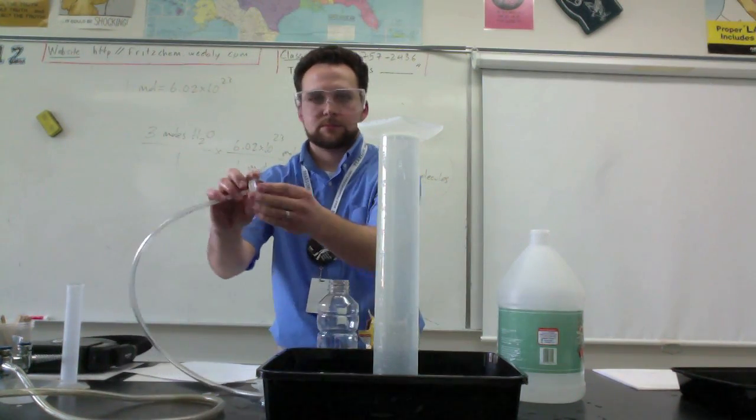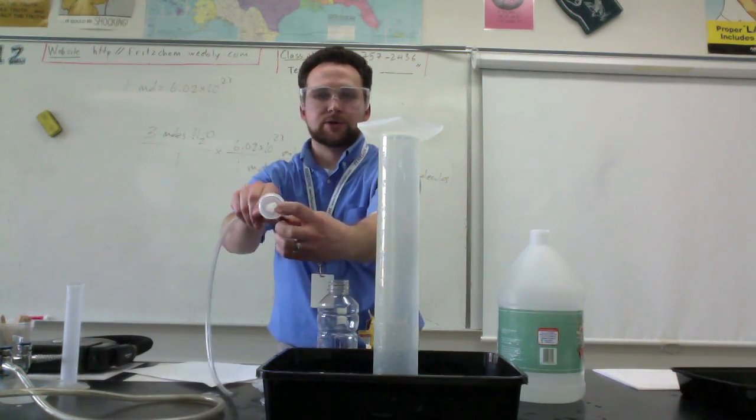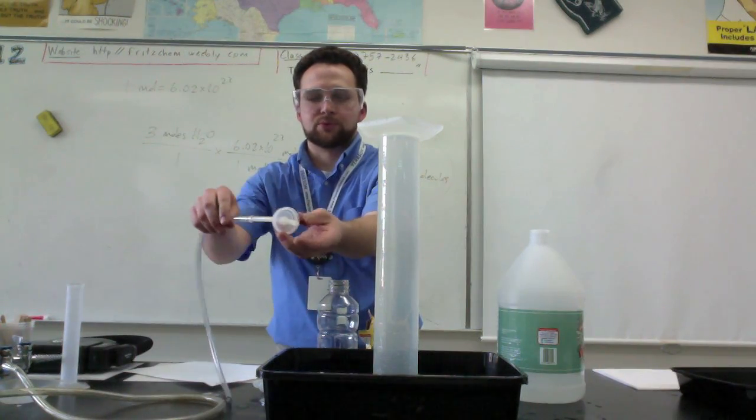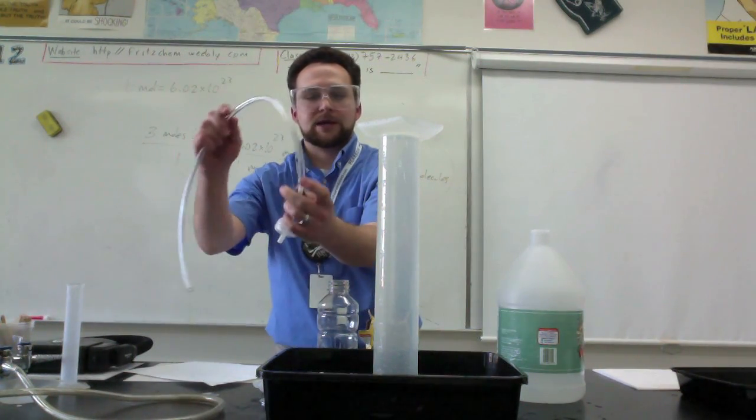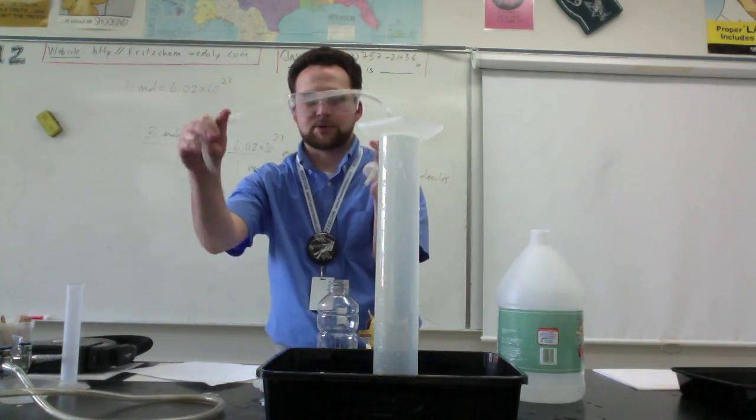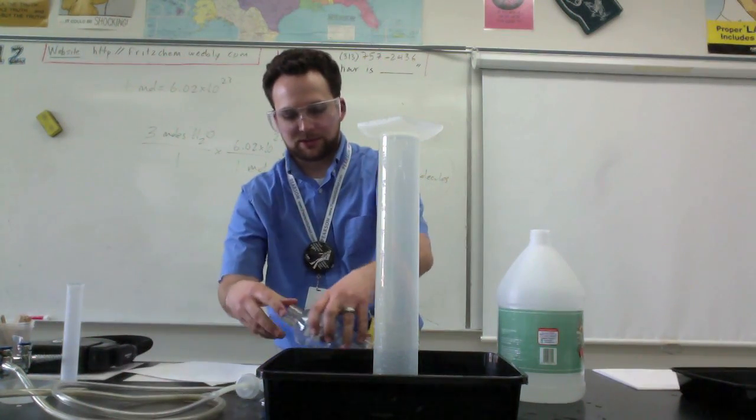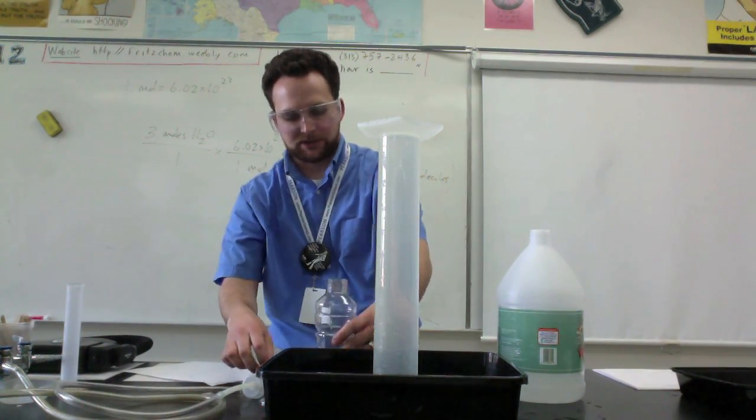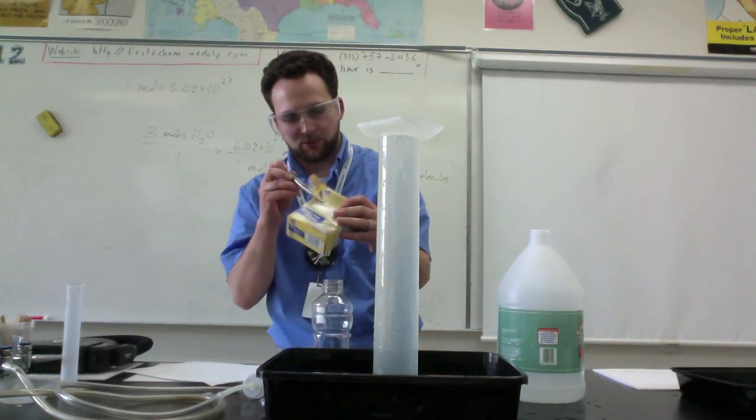Then I've got this cap here, it's sealed with rubber cement, so pretty well tightly sealed environment. It's just connected to another piece of tubing here so air can go in and out, or gas or whatever you're going to make. So I'm going to tip this thing on its side, well, I guess not yet.